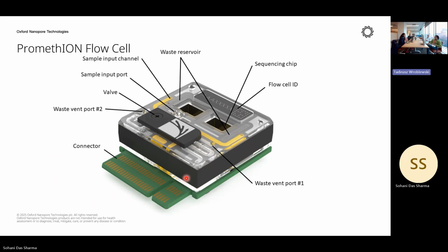So when you are sequencing, you will lose data to genomic DNA, because fragmentation is not a purification step. It's just to get more data out of your sequencing. Right? So what I would be concerned about is, if I don't fragment and I'm looking for cfDNA, it will block my pores, right?